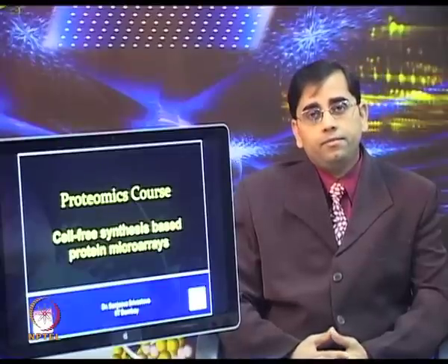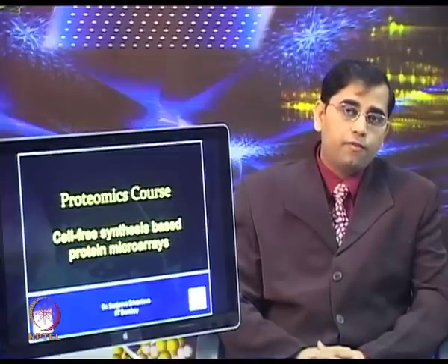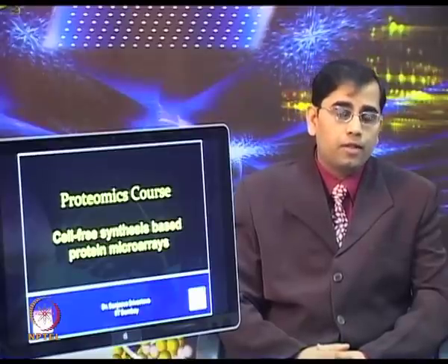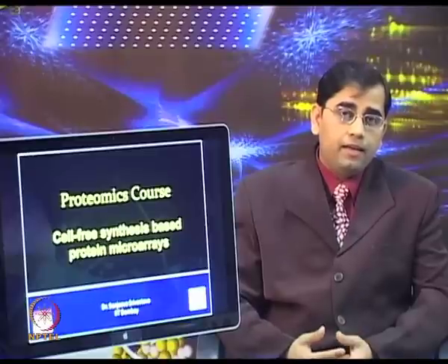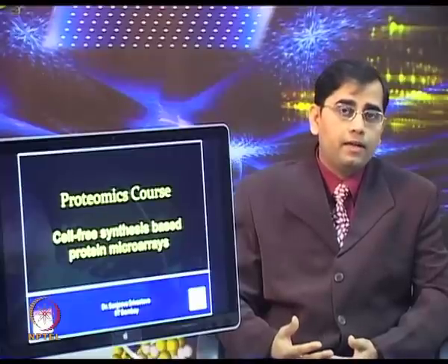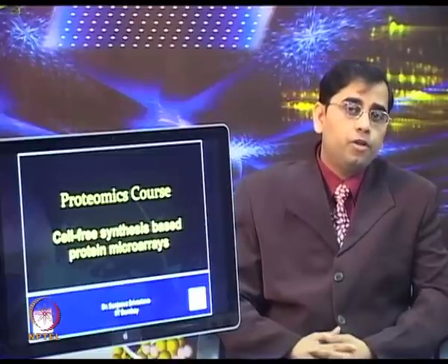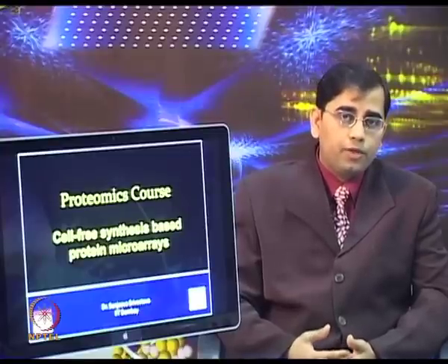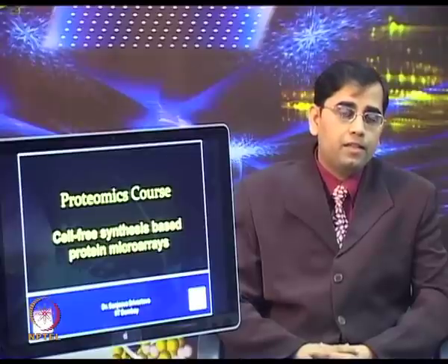So, if we have to generate a high throughput, large number of proteins which is required for performing protein microarray based studies, it is very tedious, because one needs to purify a large number of proteins on the thousand scale, and then maintaining the functionality and keeping them properly folded is very tedious. So, these limitations of traditional protein purification, and of protein microarrays generated using these purified proteins, have been the major motivation for the cell-free expression based protein microarray field.